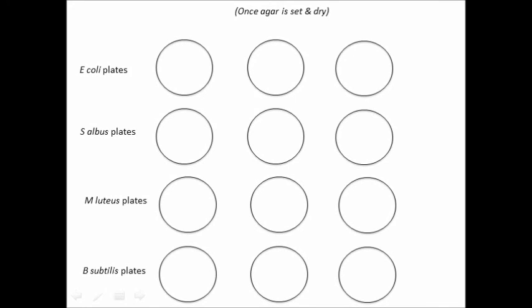Now use the appropriate dispenser to place a disc of your chosen first antibiotic onto one of the three plates for each species. In other words, you'll add a disc to a plate of E. coli, another disc of the same antibiotic to a plate of Staphylococcus albus, and then one each to the remaining two bacterial species. Label the dishes clearly with the name of the antibiotic you've used.